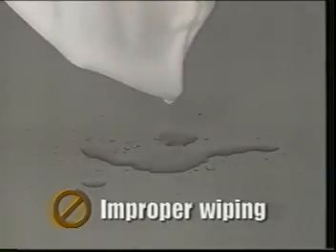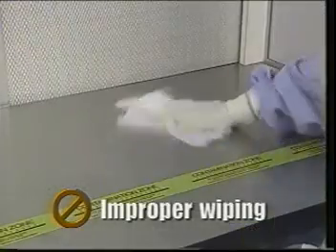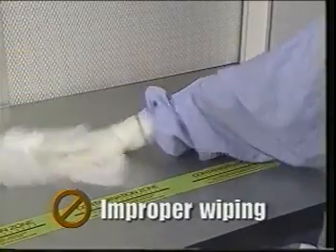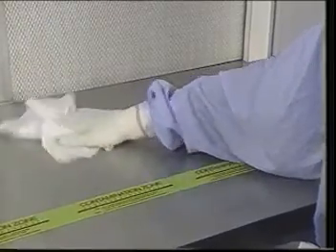Now, is there really a correct way to use a wiper? Absolutely. And since your goal in doing so is to remove contaminants, the last thing you want to do is redeposit what you captured in the wiper back onto the clean surface. With that in mind, you must not forget the fact that the wiper is a finite reservoir. Exceed its capacity, wipe too fast, or wipe in more than one direction, and you defeat the ability of the wiper to successfully remove contaminants.